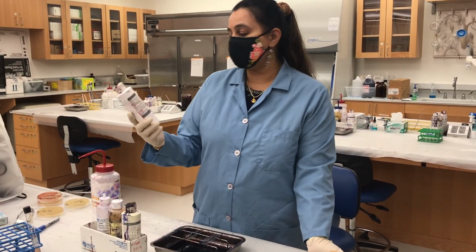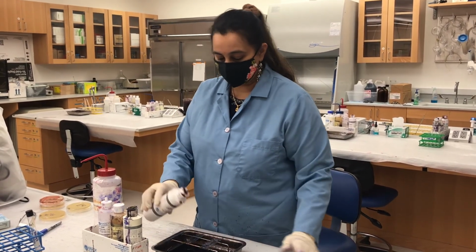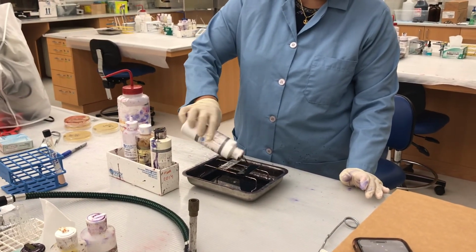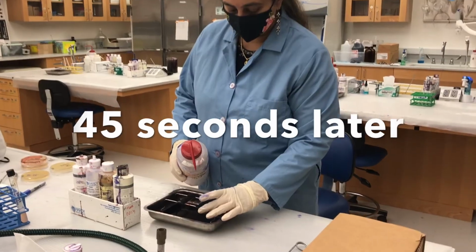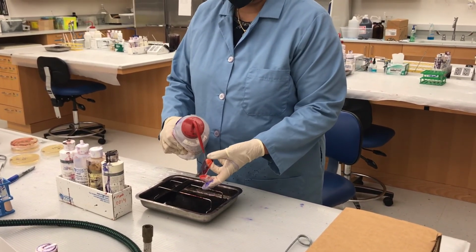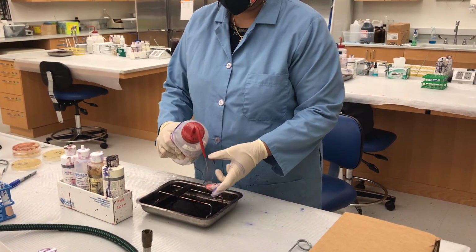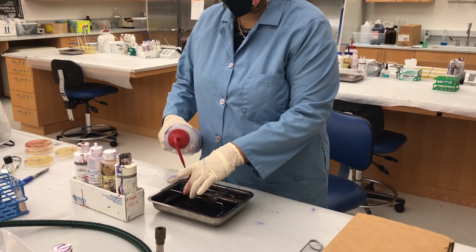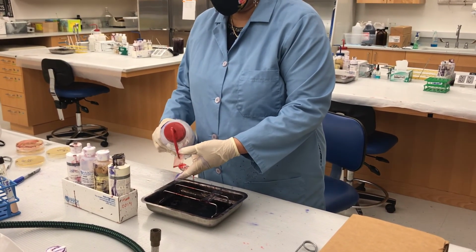The final step is to add your secondary stain, which is safranin. The same way, completely flood the slide using safranin and start your timer. And now wash front and back with distilled water. Same way, I have the liquid culture smear. Wash front and back.